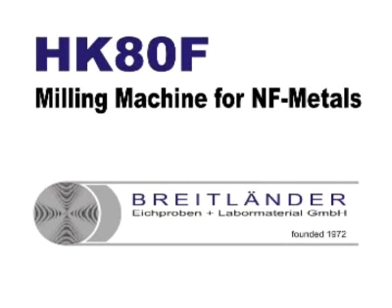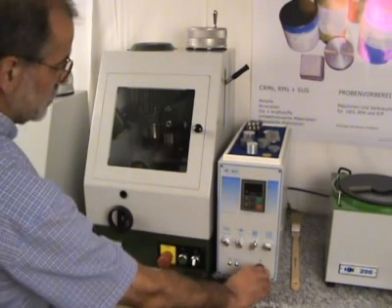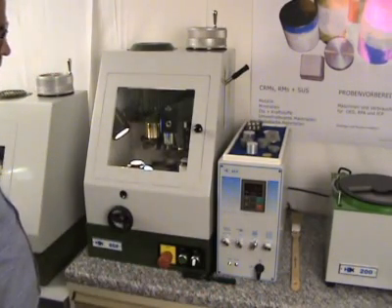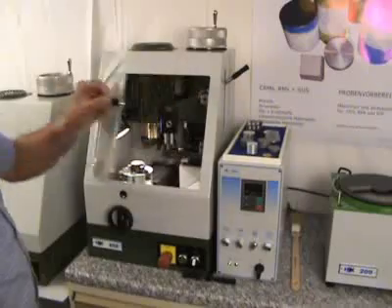This video demonstrates sample preparation by milling of non-ferrous spectral samples. The main switch on the control unit is switched on. The machine is reset into start position.